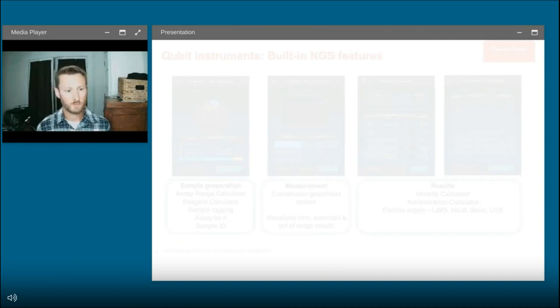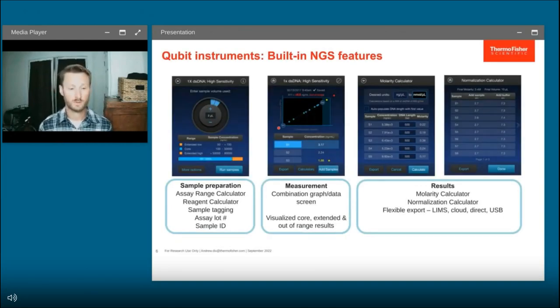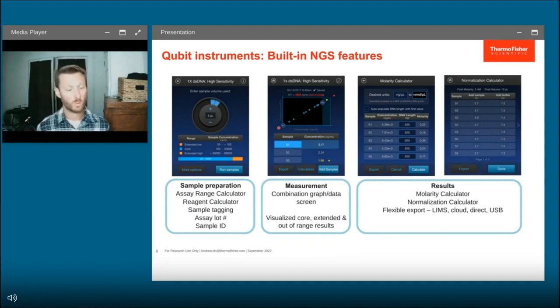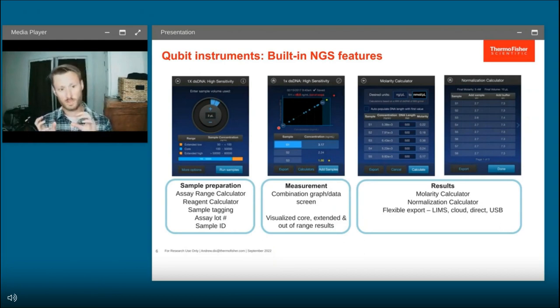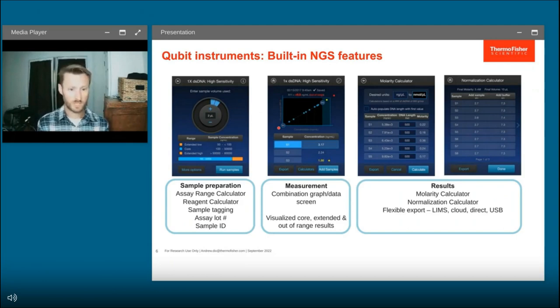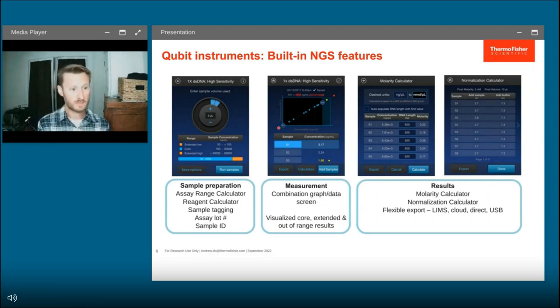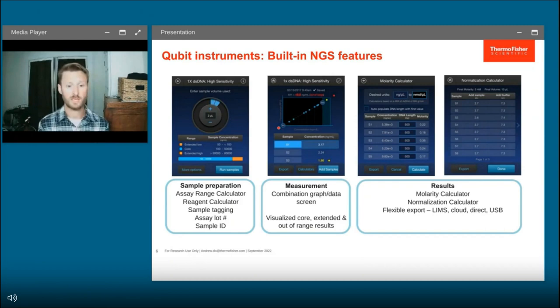I want to highlight a few onboard features of the Qubit Flex Fluorometer built specifically for next-gen sequencing users. First is the sample preparation calculator — most users use only 1 to 2 microliters of sample, which can affect the detection range. This gives you a check before you begin to make sure your presumed sample range fits the detection range. The next screen gives a pictorial representation of where your sample concentration falls within the dynamic range. If your sample falls at the low end, you may want to use more sample or consider PCR for extra sensitivity.